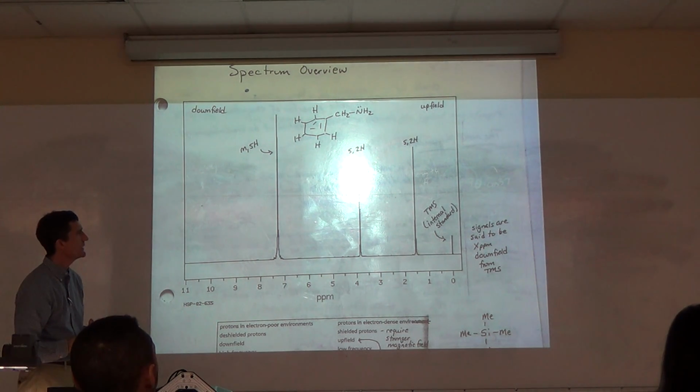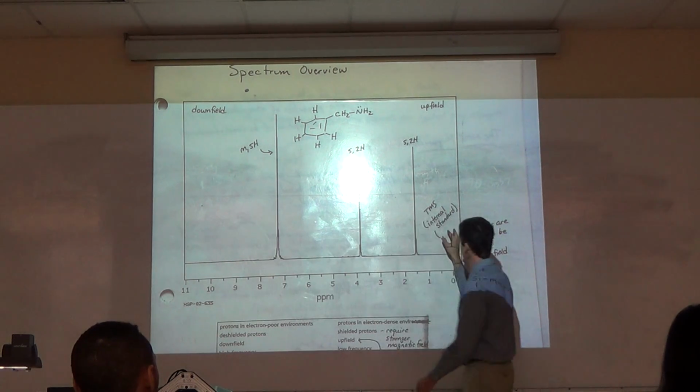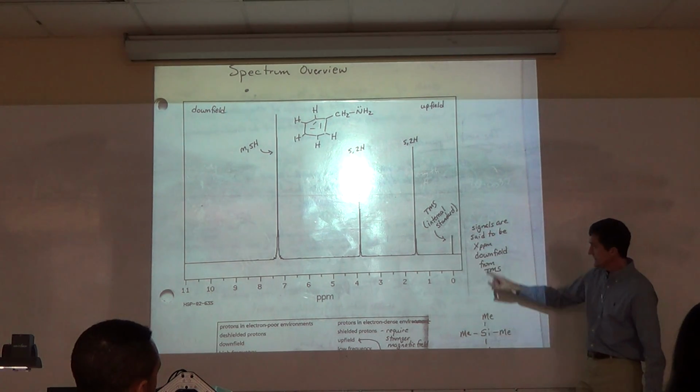Let's don't talk about that. When you do NMR, typically you have to include an internal standard. Most common internal standard is this guy here, known as TMS.